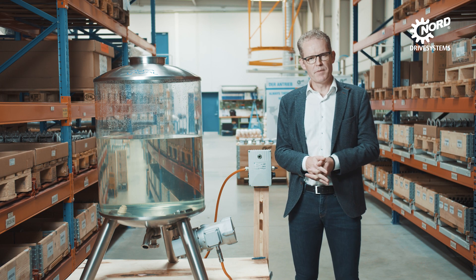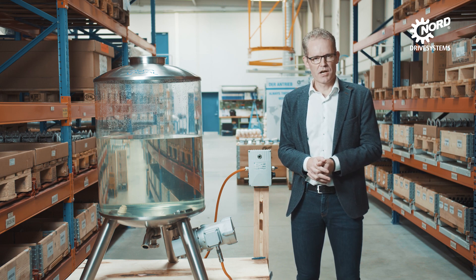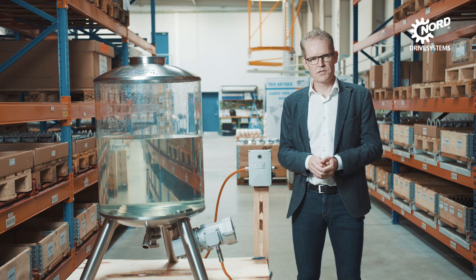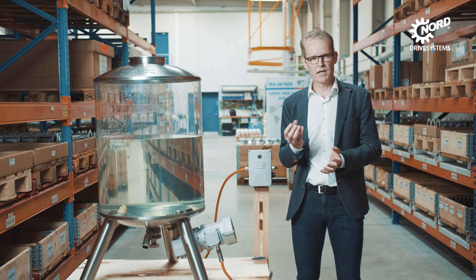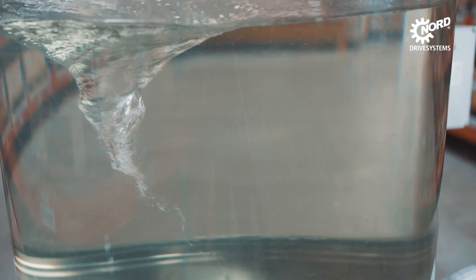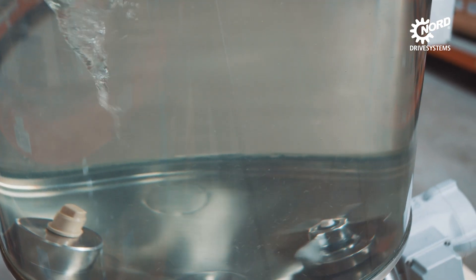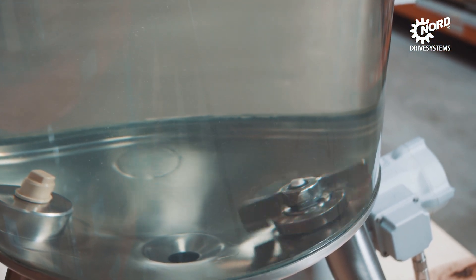With the Alfa Laval Levimag, we mainly meet the requirements for high purity. A common challenge with mixing is that bearings can cause grinding of the media. With a levitated process like this, where we have a magnet drive, there is no contact in the bearings inside the media, meaning no grinding of the media and no tear and wear on the bearings.